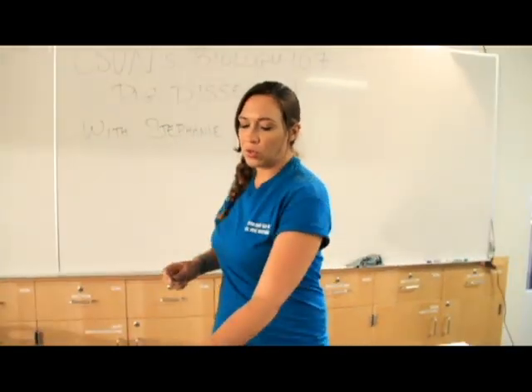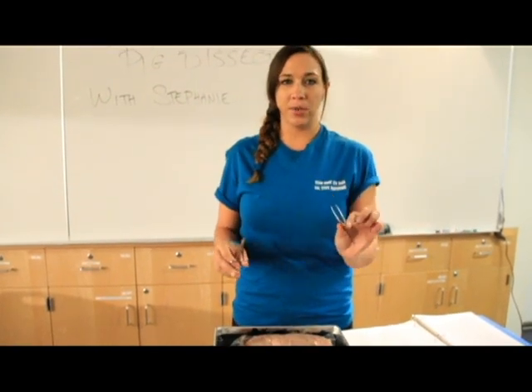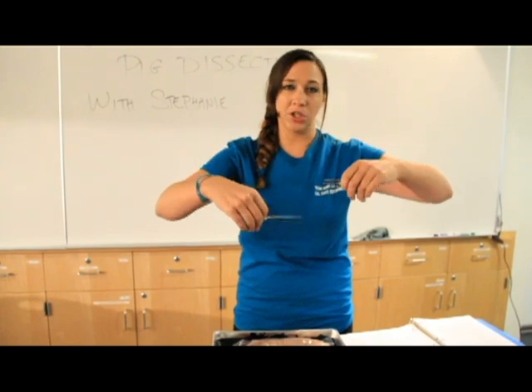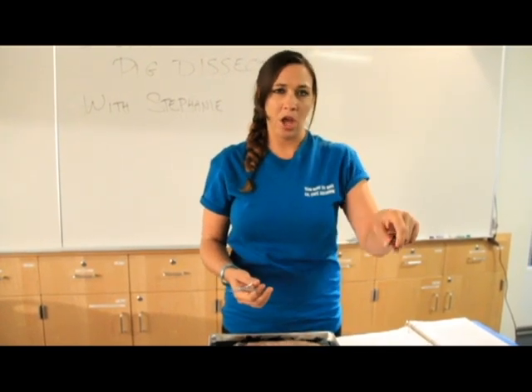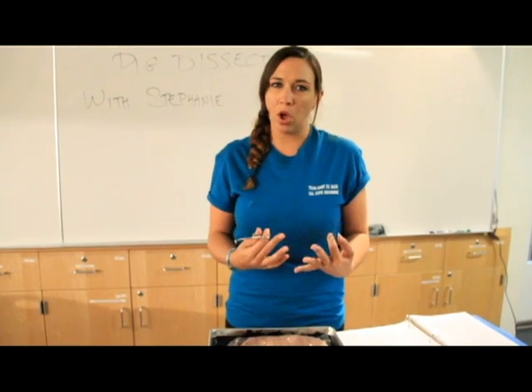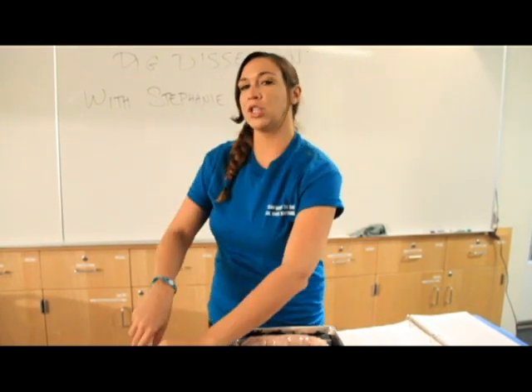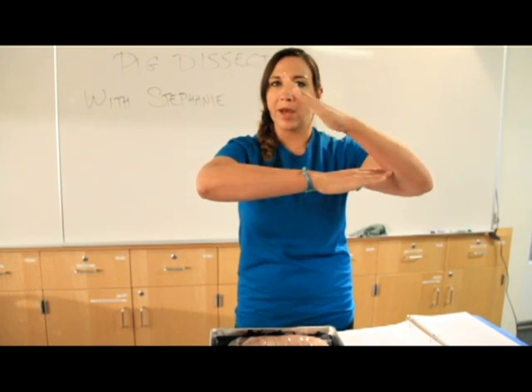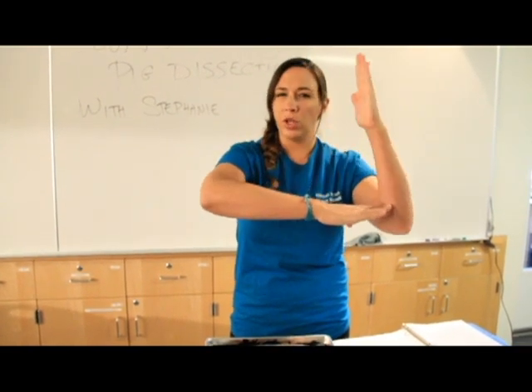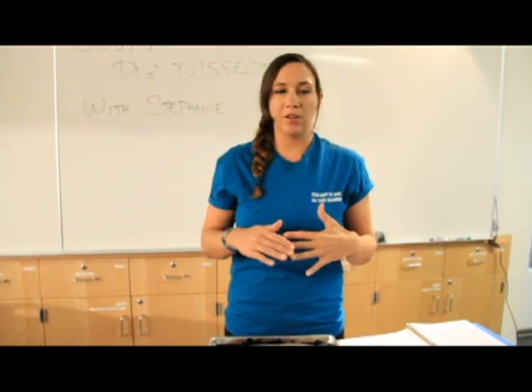The two tools that you really should use most often are your tweezers and your scissors. That's because you want to lift with one hand and cut with the other. It should always be the same person doing the dissection, not one person holding tweezers and the other cutting. You really want to control and make small cuts. What you want to do is lift up the skin layer by layer. We're going to cut single layers right at that connective tissue to slowly pull back that skin or whatever layer that we're getting into.